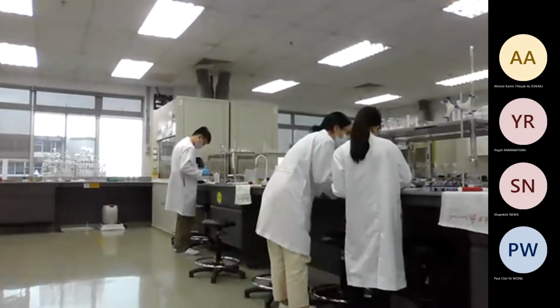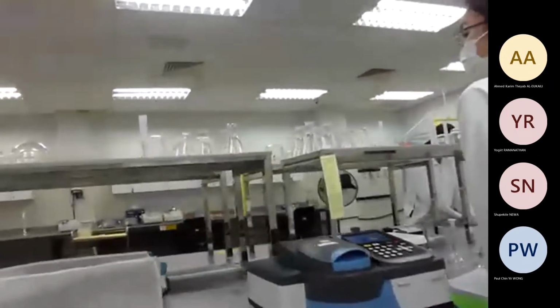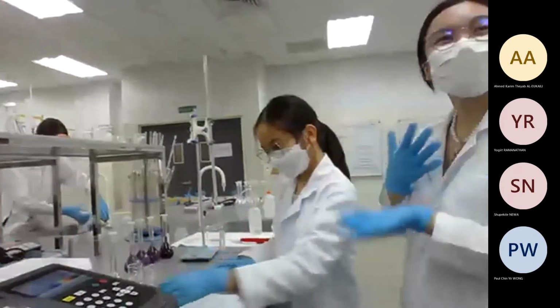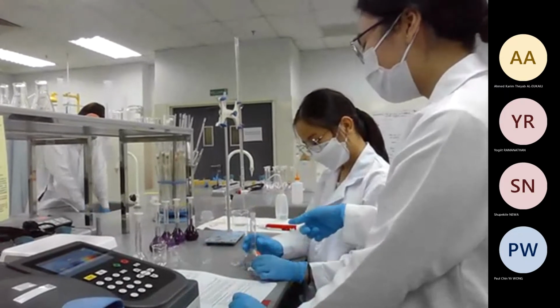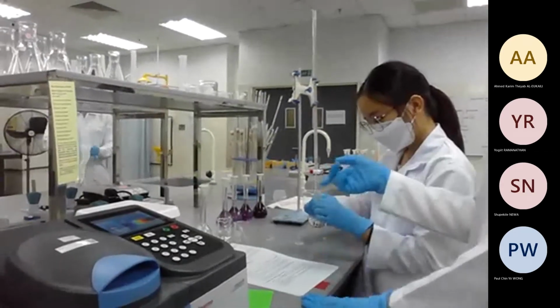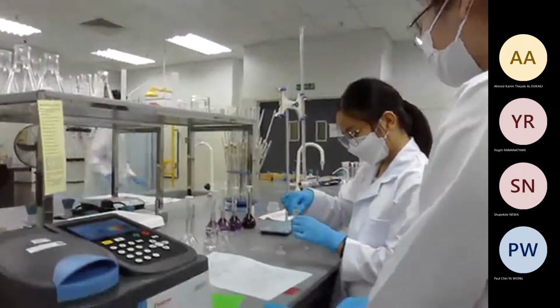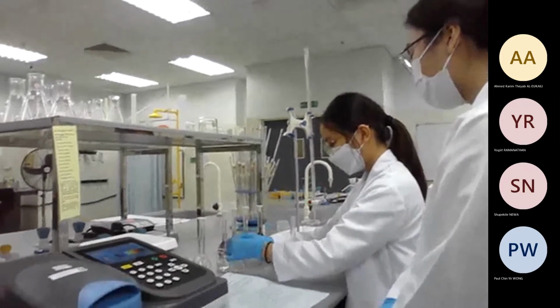So your online friends probably don't know what you guys are doing. Can you give a live commentary of what you're doing? We are thinking on how to do this tutorial. Do you have to use a dropper or do we just? No, you can use that one. Just use a little, 1-2 drops, rinse it, then fill it up later on. Okay, yeah, can rinse it. Throw it in the other, yes.